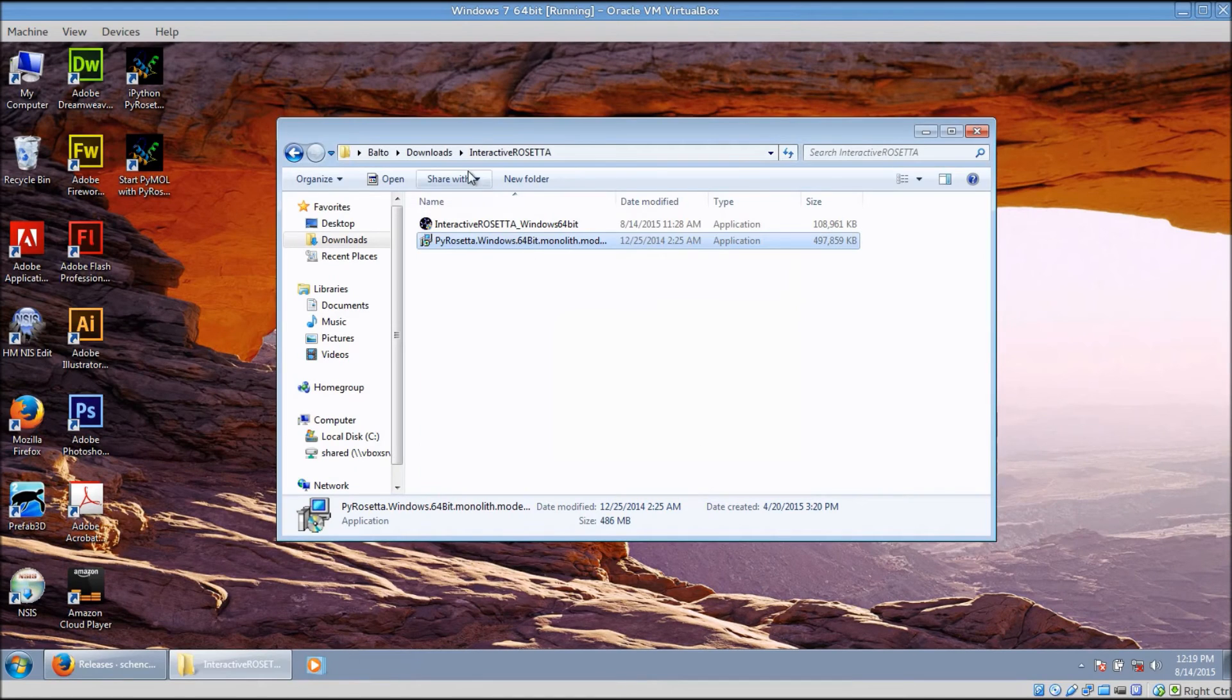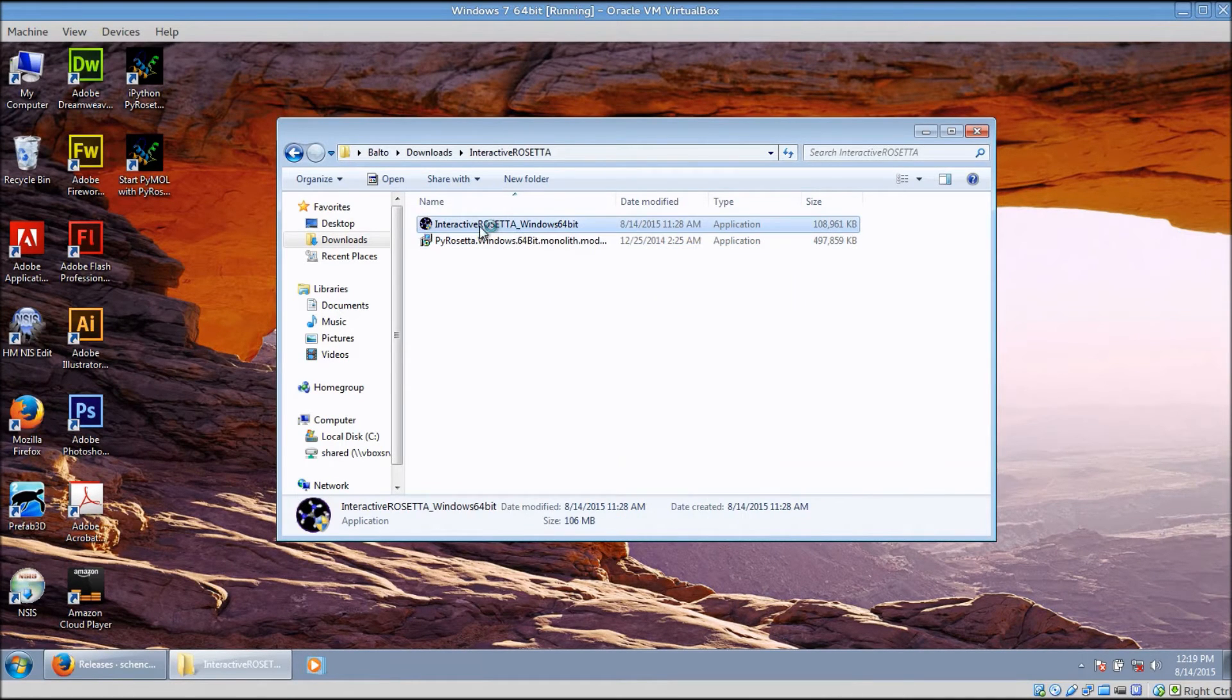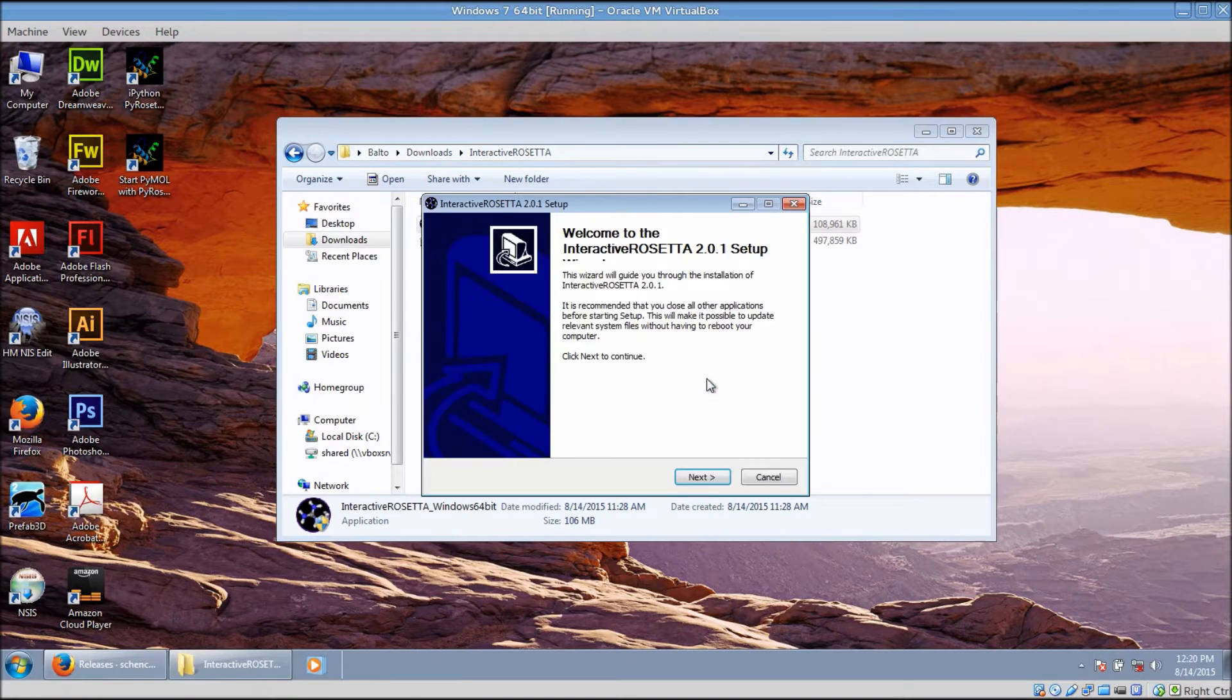Okay, now that PyRosetta is installed, you can install Interactive Rosetta. Double-click on the installer.